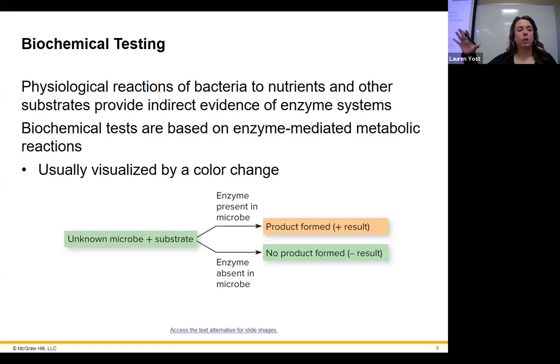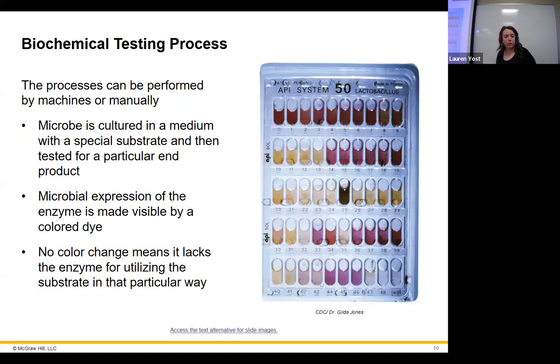So we already know a biochemical pathway from at least one of those media that we have in the lab. It could be something like mannitol fermentation, or it could be lactose usage, like we saw with both MacConkey and EMB, right? So those are metabolic pathways too. We're doing all this on individual plates, a plate of mannitol salt agar, a plate of EMB, testing lactose usage versus mannitol usage. There's other tests we're going to do to look at sulfur gas production, and gas production in general in anaerobic environments, and all of this.